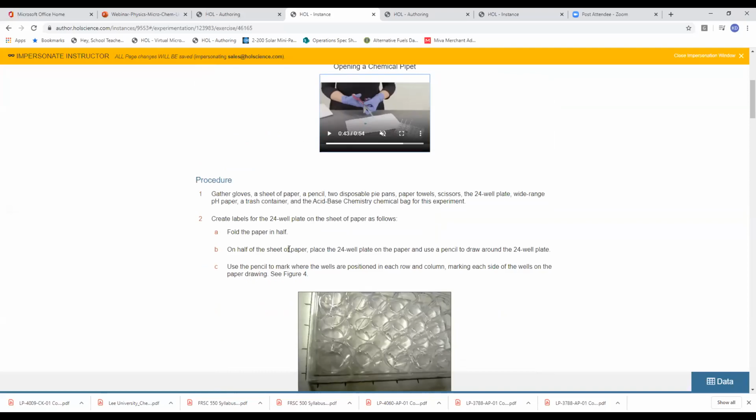Now, we design our procedures in very clearly written steps. The biggest challenge that a remote science student has when conducting laboratory procedures is that they can't raise their hand when they have a question. So unlike your on-campus students, they can raise their hand and have their TA or yourself walk over and explain a procedure or actually physically show them how to do something that they're unclear about. Your remote students do not have that benefit.